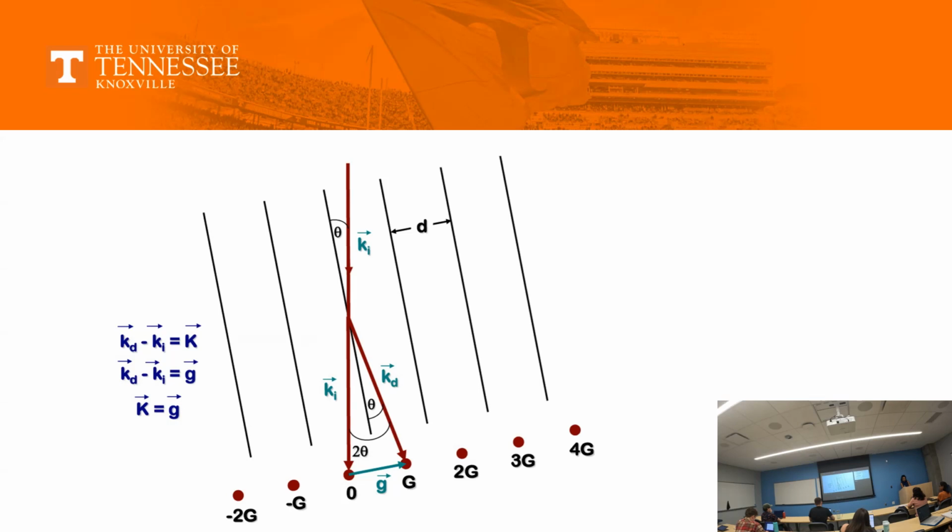Why is it a monocrystal? You're so zoomed out, what you're seeing is the diffraction coming from literally a nanometer zone, and you can literally create lattices around it. If it starts to become polycrystal, which I will give you as an example on the next slide, then you won't have these clear spots. So the beam is centrally aligned.